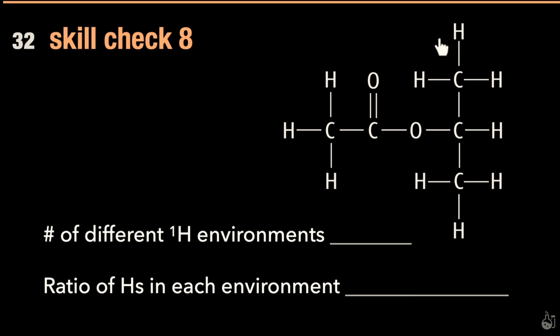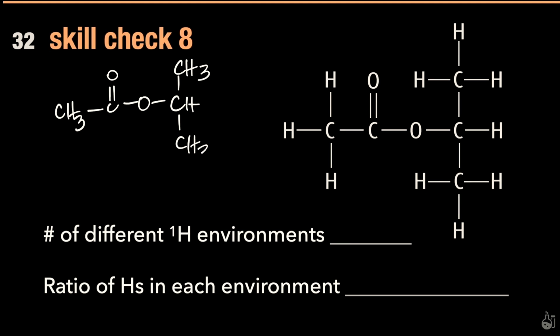Now let's look at this molecule. Sometimes it becomes a little overwhelming to look at the whole structure, so I always write it in my own way that I like to. CH3CO, CH, and up there is also CH3, and below too. Now this makes it a little easier because I know I have 3 CH3s, but these 2 are identical. So I got 1, 2 environments and 3.